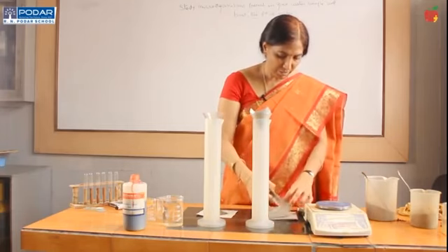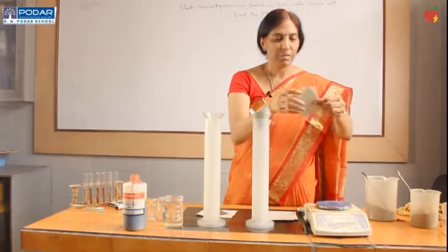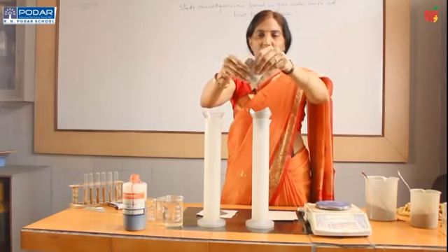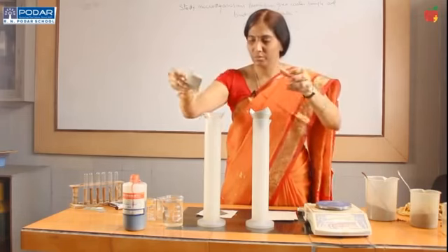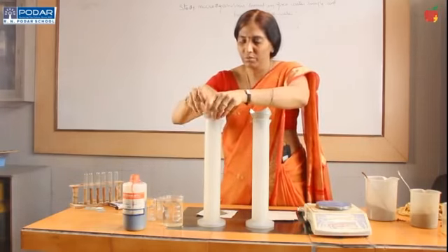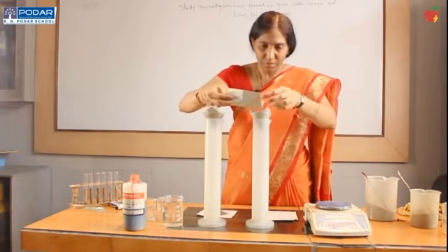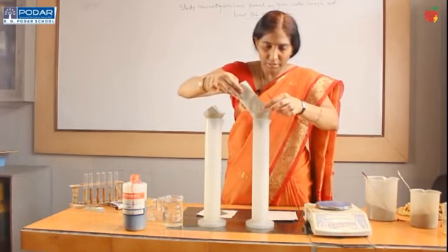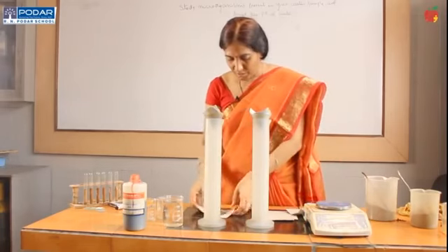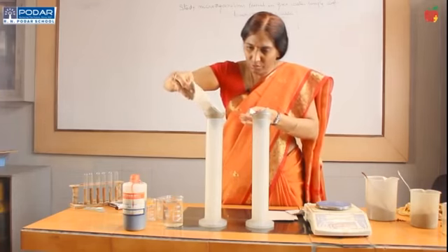One more funnel I am preparing, fold like this, first fold, after that like this again. Now I am pouring garden soil into this funnel carefully, and roadside soil also into the other funnel.